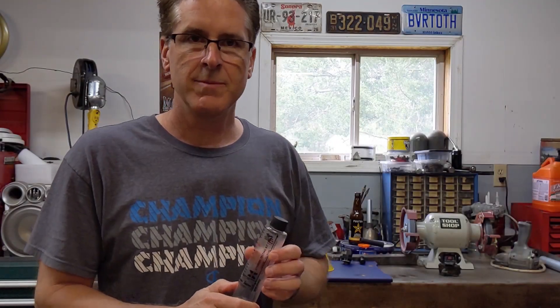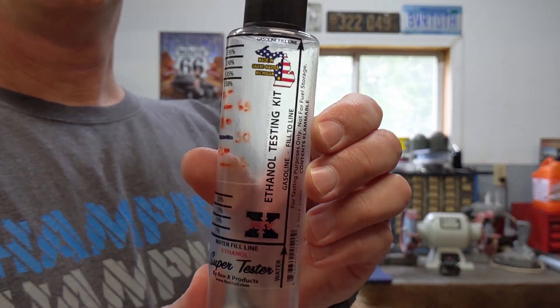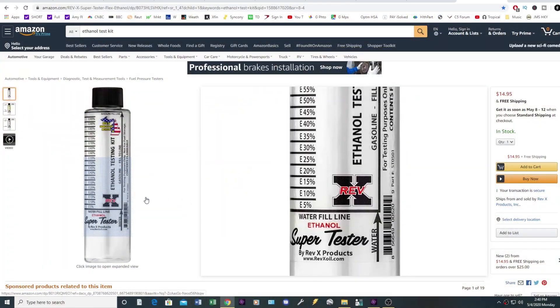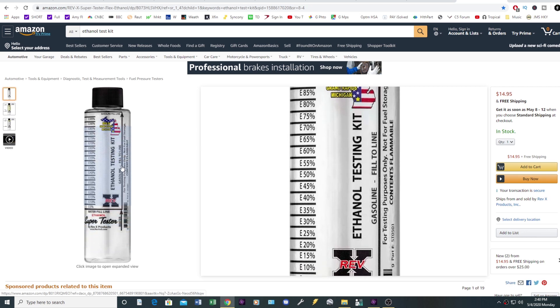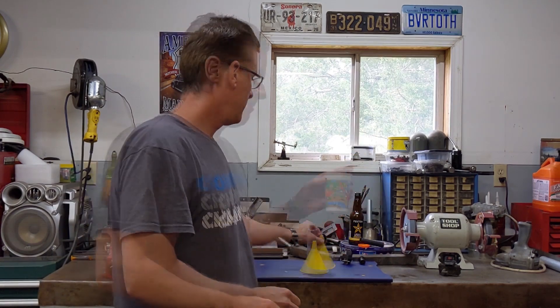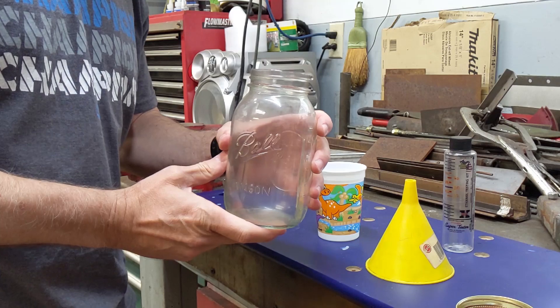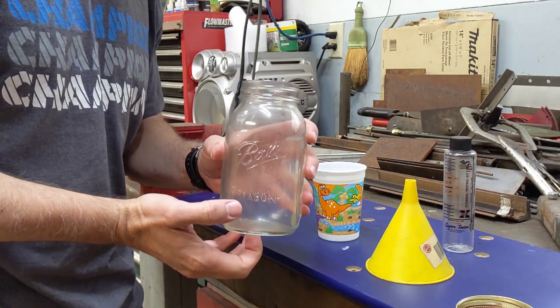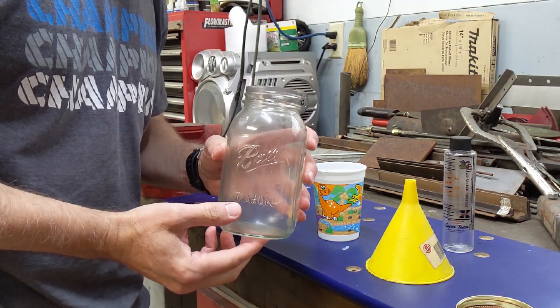So I'm going to test it to make sure I know exactly what ethanol is in my fuel. The first thing you need to be able to test your own ethanol is one of these test kits. I got this from Summit Racing, but you can get it from JEGS or Amazon. The next thing you're going to need is a clean funnel and just a little bit of clean tap water. And one more thing you need is a clean glass jar — you don't want to use plastic because the E85 can attack certain plastics.